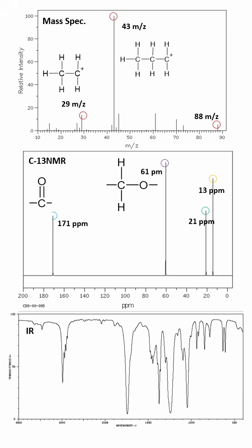Okay, if we go back down and look at our IR graph, we can see that there is this distinctive peak at 1740 cm⁻¹. That is, of course, going to be our carbonyl group produced from the C=O stretch, and then we get the C–H stretch producing this peak at 3000.